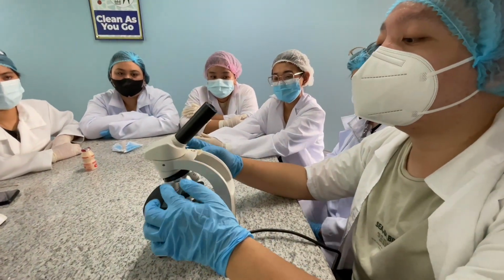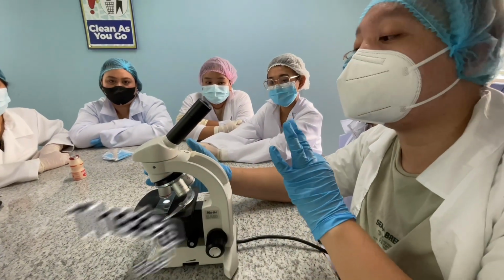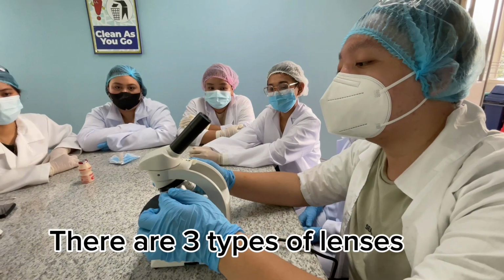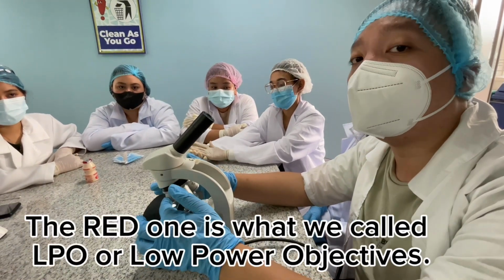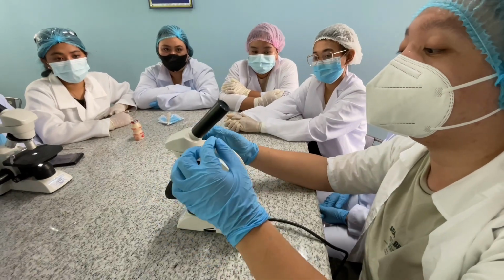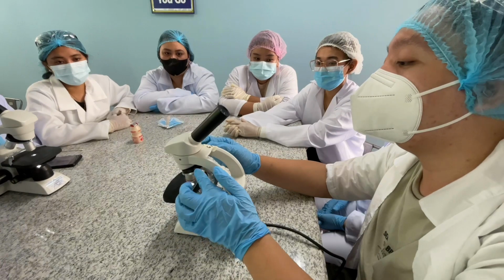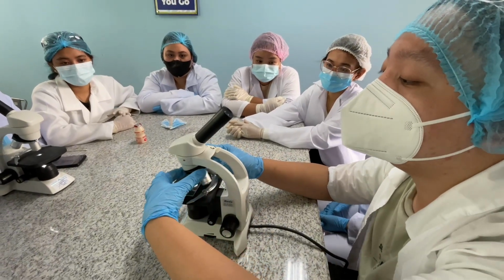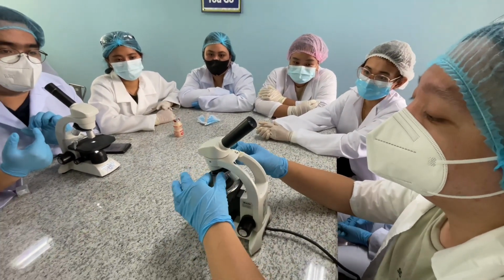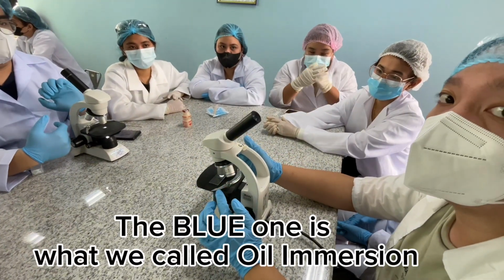And holding the revolving nose piece are the objective lenses. As you can see, there are three types of lenses that we have here. The red one is what we call the LPO or the low-powered objective lens, which is for general use and also for magnification and low-powered. And then we have here, as we rotate it, the blue one, what we call the oil immersion objective lens.